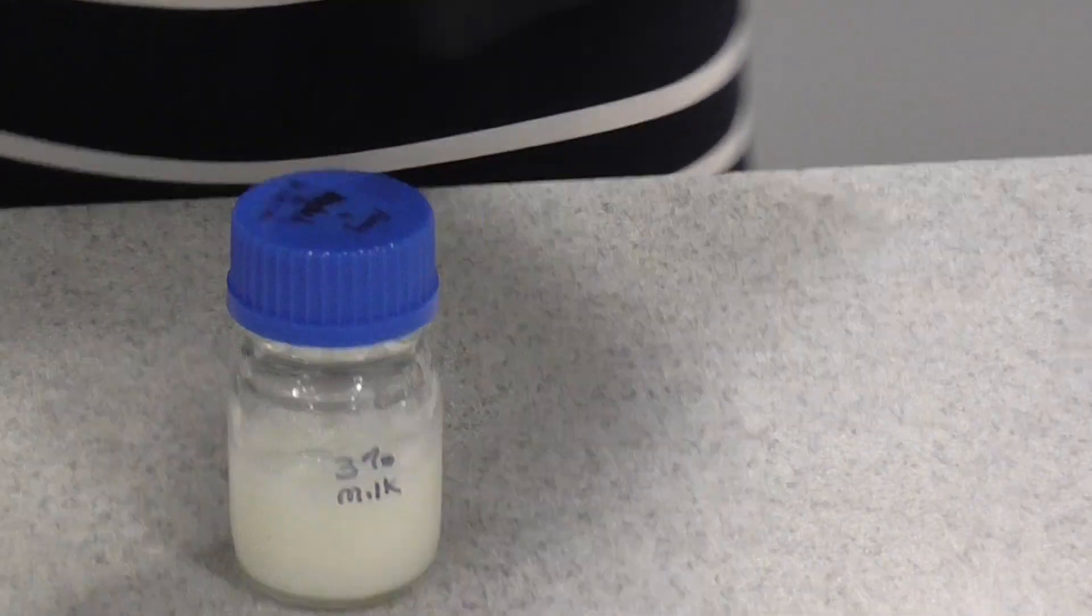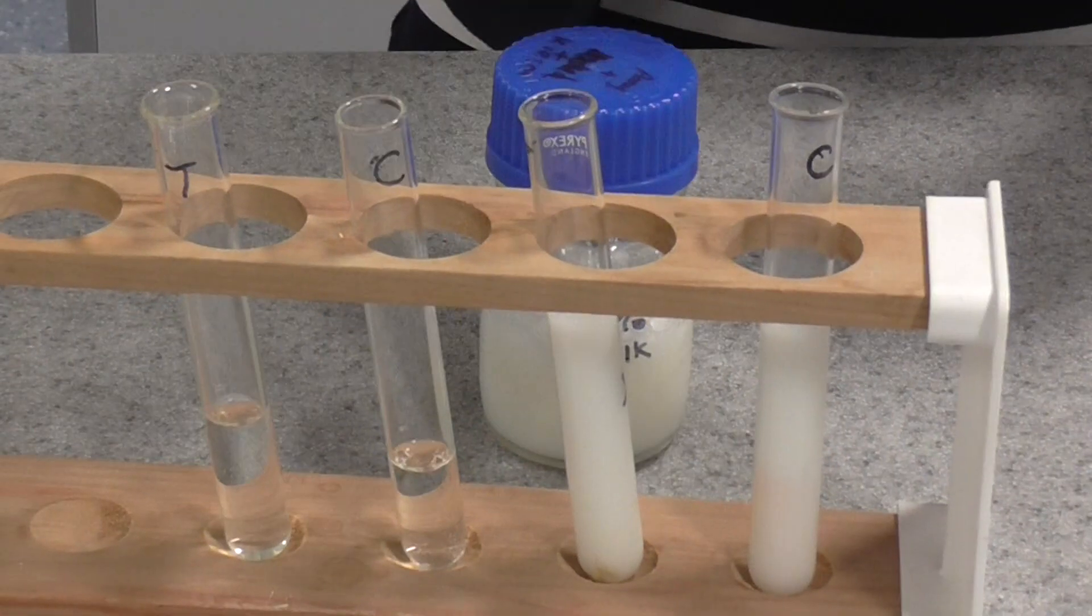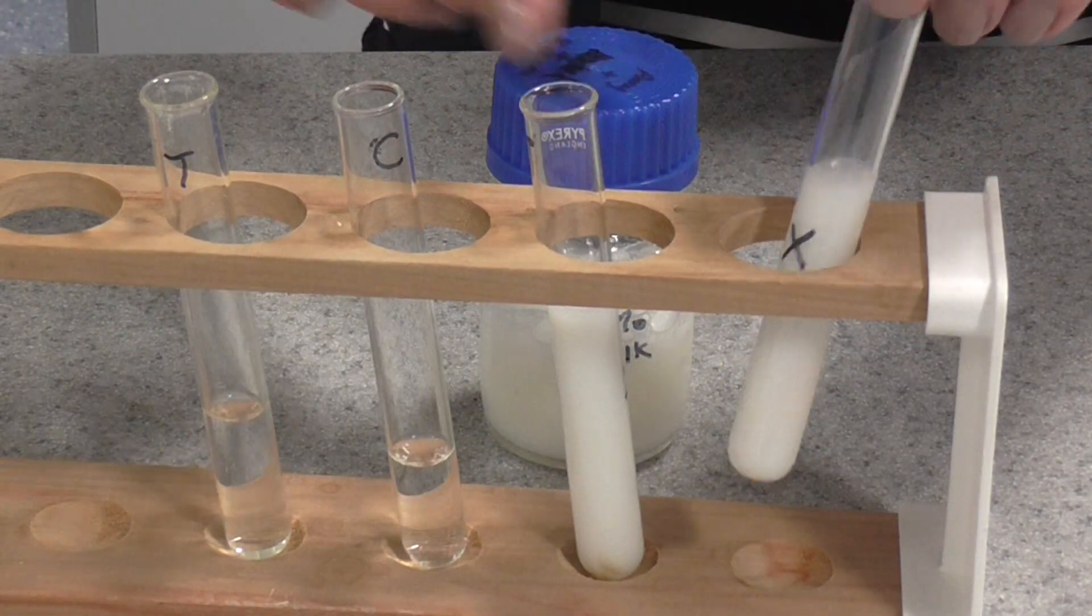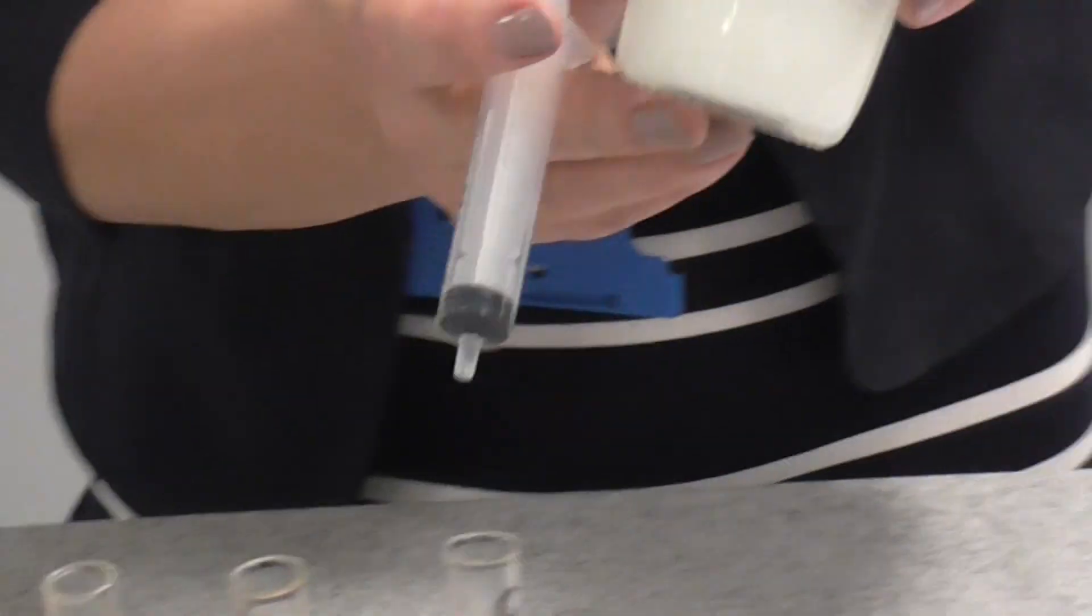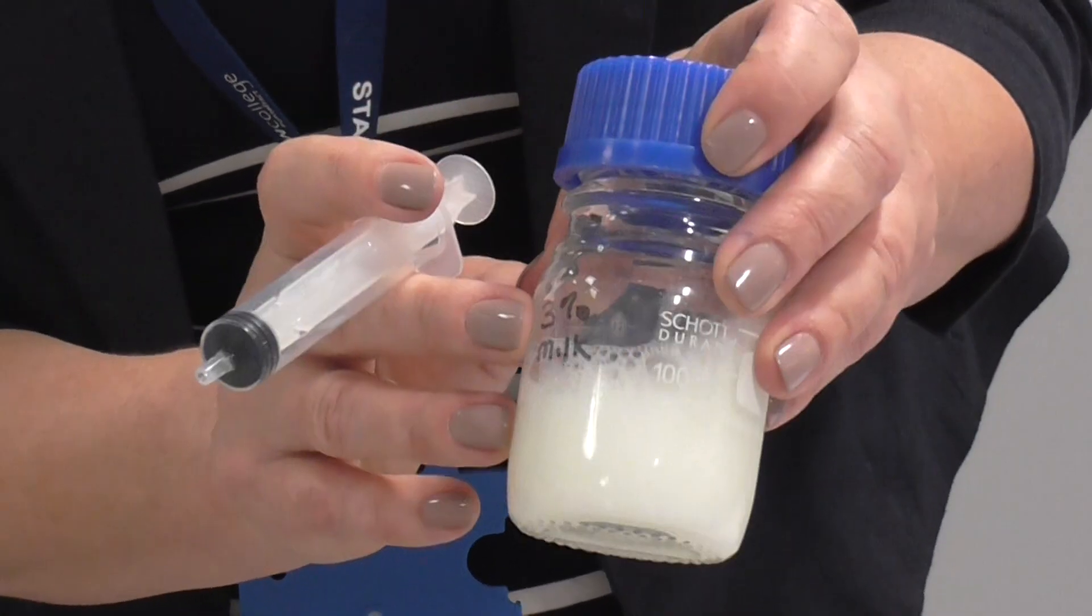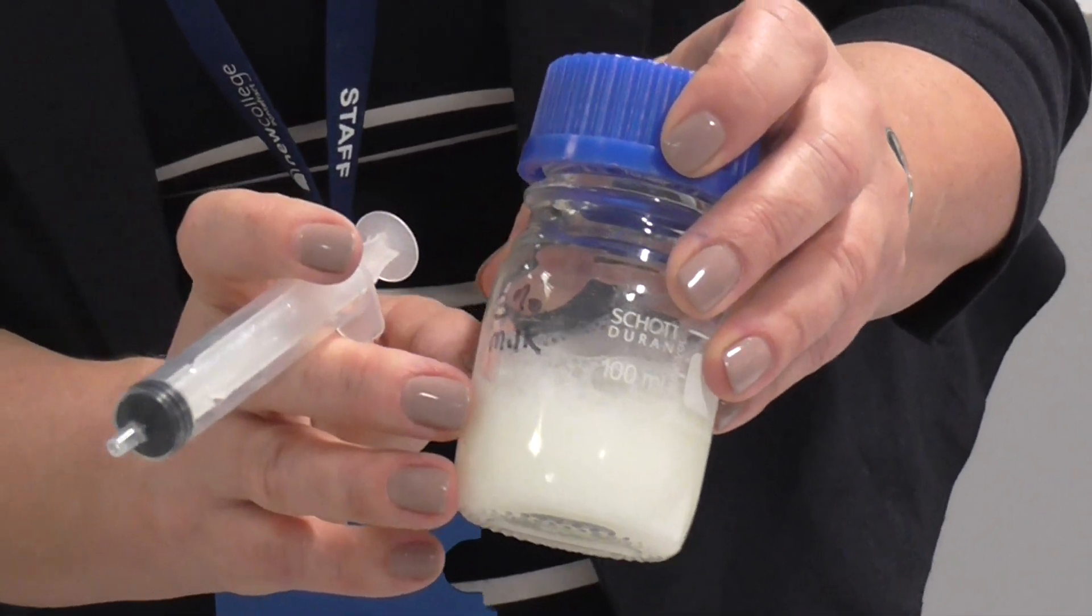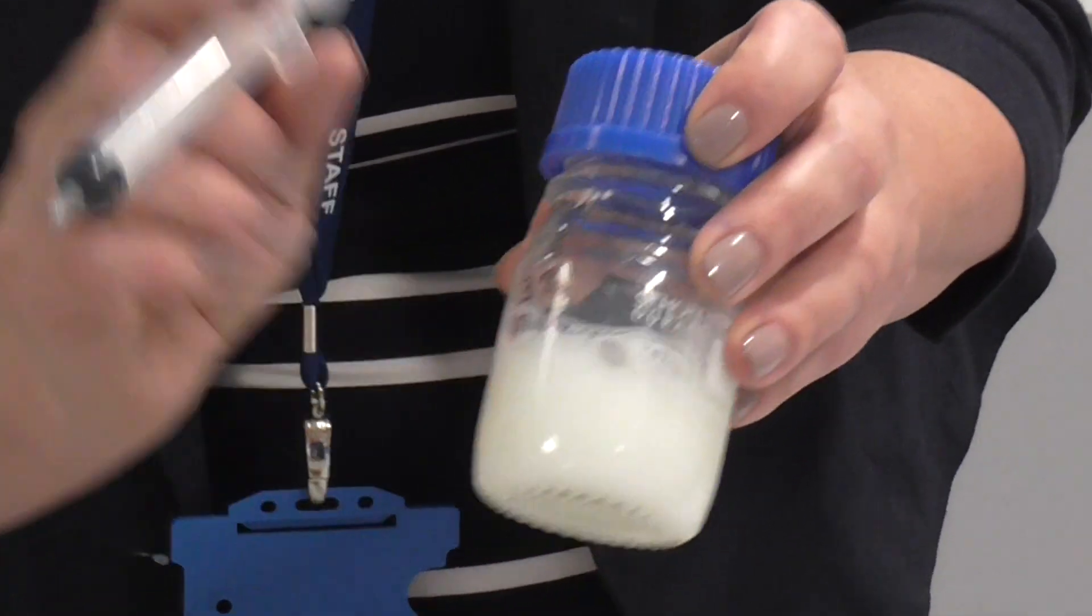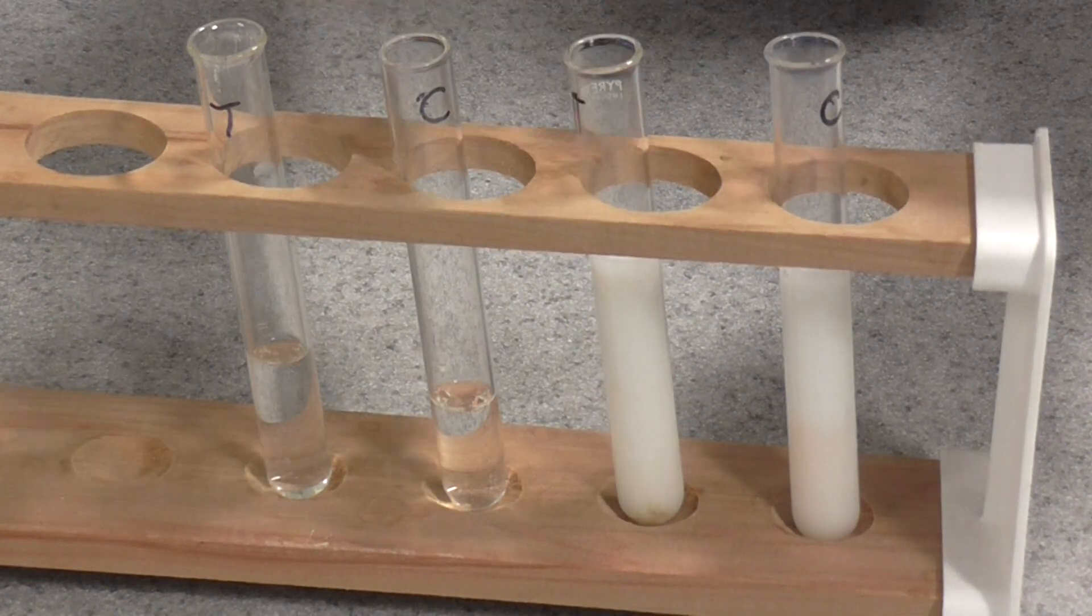Into your two test tubes, T and C, notice you've got the crosses on the back there, you need to use a syringe to put just 10 centimetre cubed of 3% powdered milk. Powdered milk works much better for this experiment. It's just your standard powdered milk from a supermarket, and make up a 3% solution. I've got 10 centimetres cubed of powdered milk solution in tubes labelled C and T.